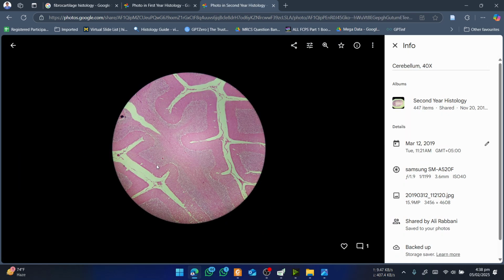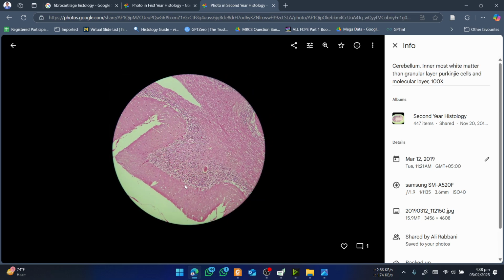In the cerebellum, you will see different layers, and these are the different layers, folia, that are called usually. And from here to here is the gray matter, and here is the white matter, and here to here again the gray matter. The gray matter consists of three layers, and if we zoom in, you will see three layers. You have this outer layer, the molecular layer. This layer of large cells is called the Purkinje layer, and this layer is the granule cells.